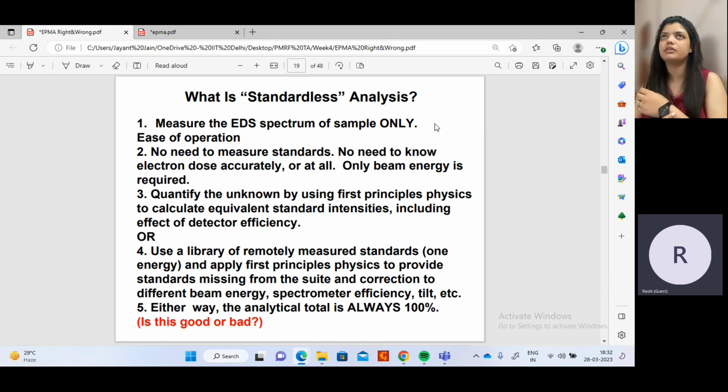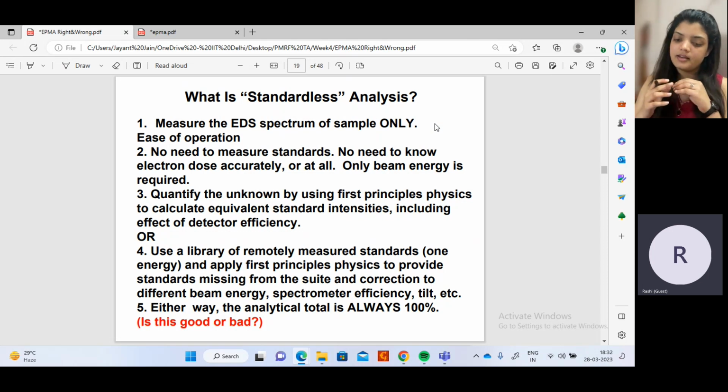The standard samples will be there always. At industrial level, people want a particular standard and want to produce the same thing again and again, and if there is some deviation, they will tell how much the deviation is. But in the case of our sample, we are not going to produce again and again. It is just a research facility.